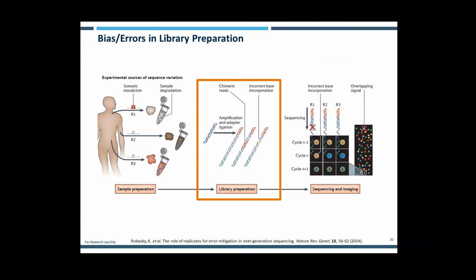And so, as I mentioned earlier, the impact of your sample variability is really affected by the approach that you take in preparing your sample for sequencing. And so now we're going to dive a little bit deeper into that library preparation step.